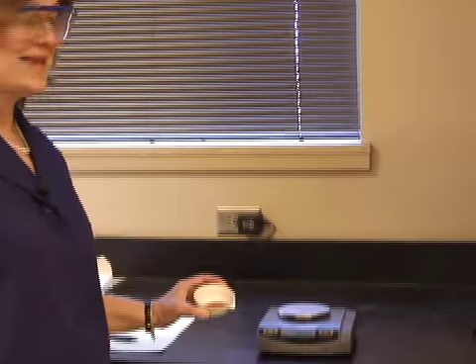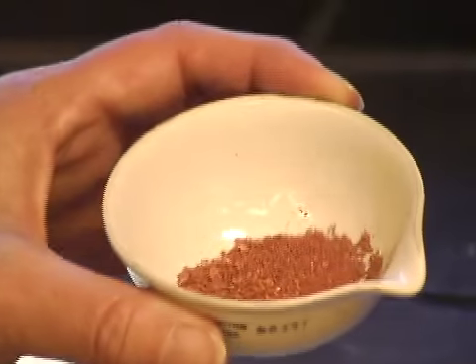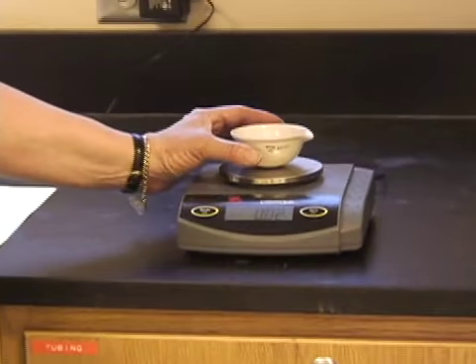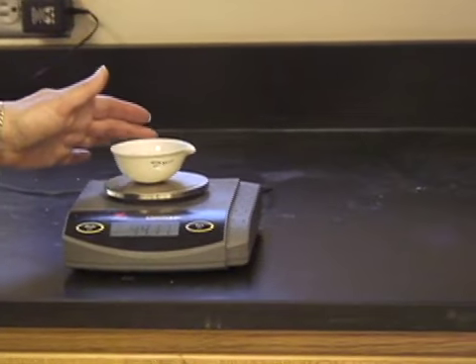Here we are at the moment of truth. Well, I have cleaned up the copper, and we have gotten it back, and it's so beautiful, and it is uniform in its appearance. There are different size particles, but they're all copper particles. And it was cleaned up and dried, and now I'm going to determine the final mass of the evaporating dish with the copper.